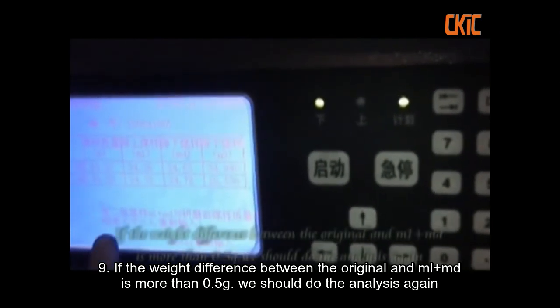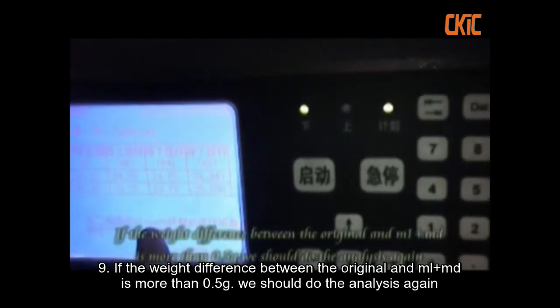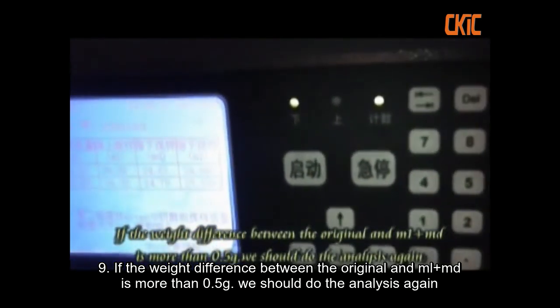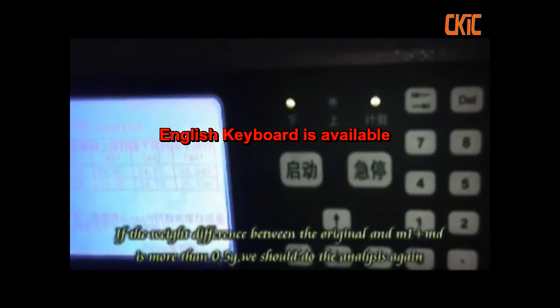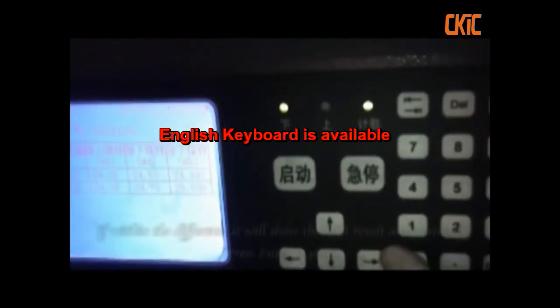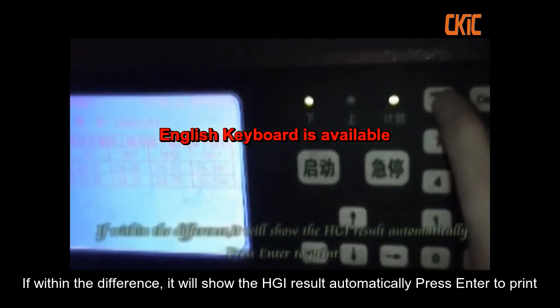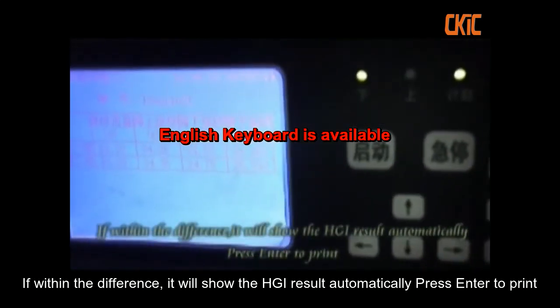If the weight difference between the original and M1 plus M2 is more than 0.5g, we should do the analysis again. If within the difference, it will show the HGI result automatically.